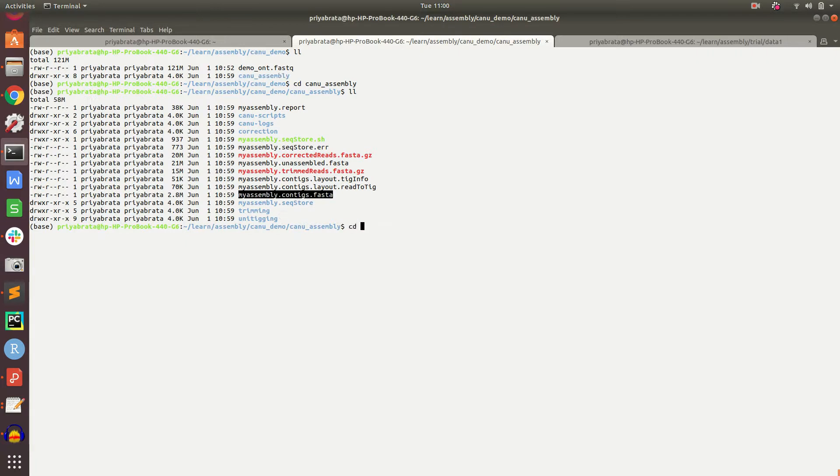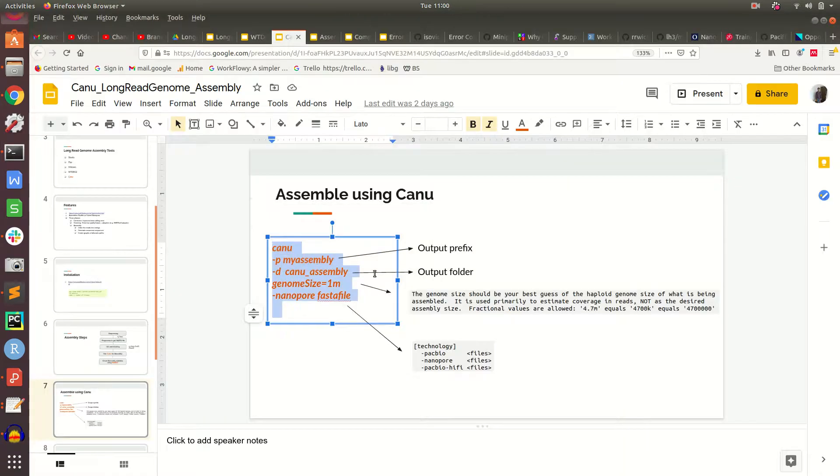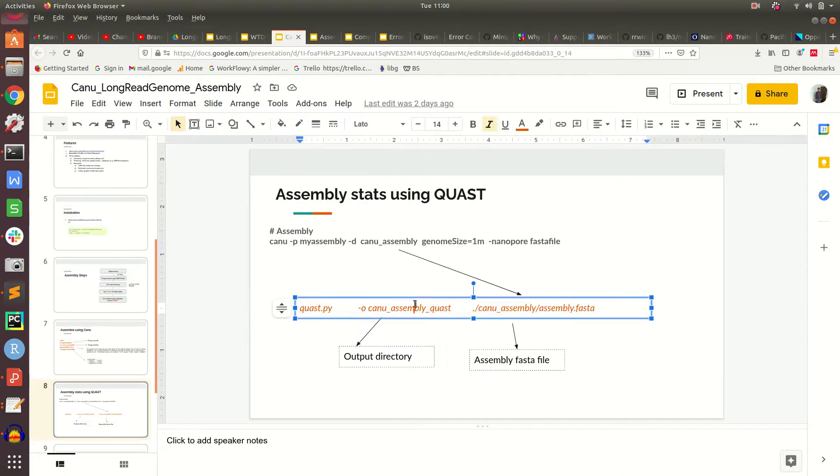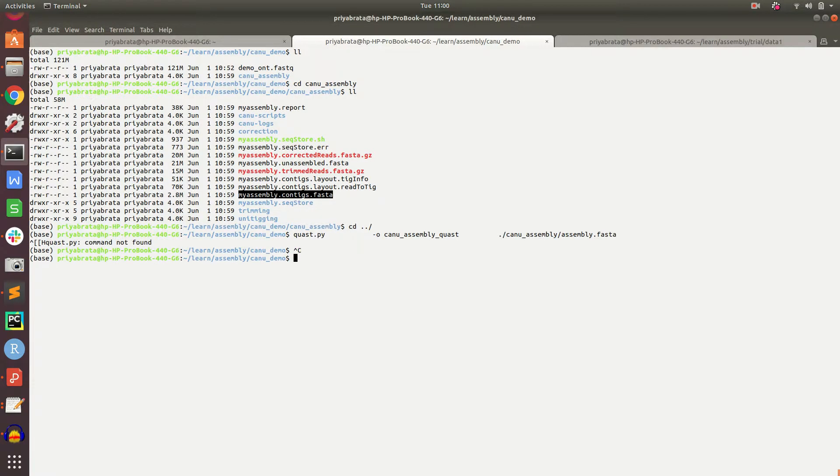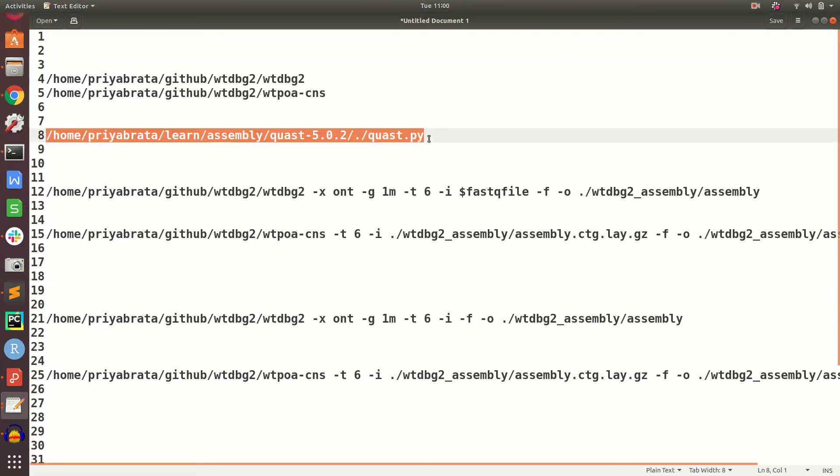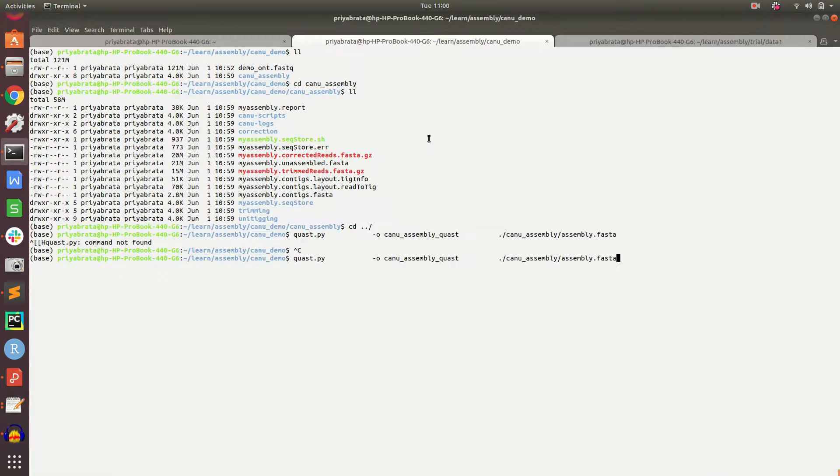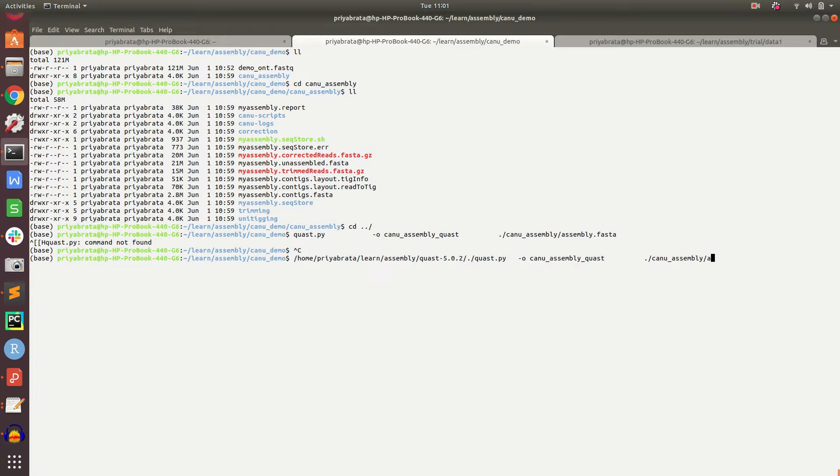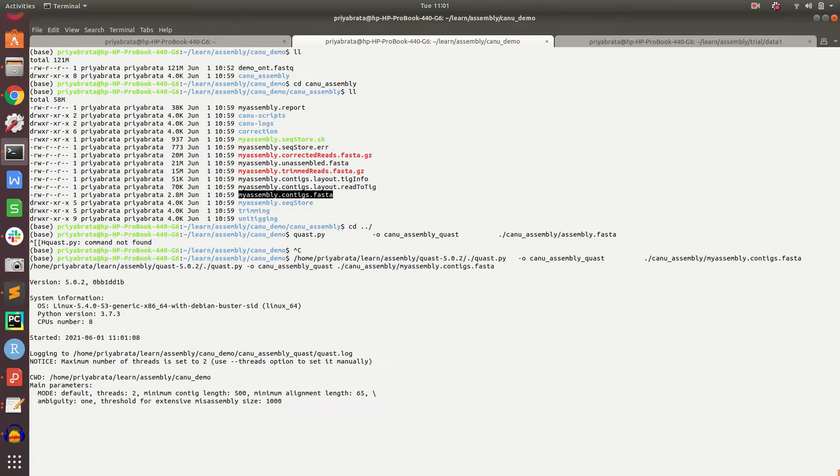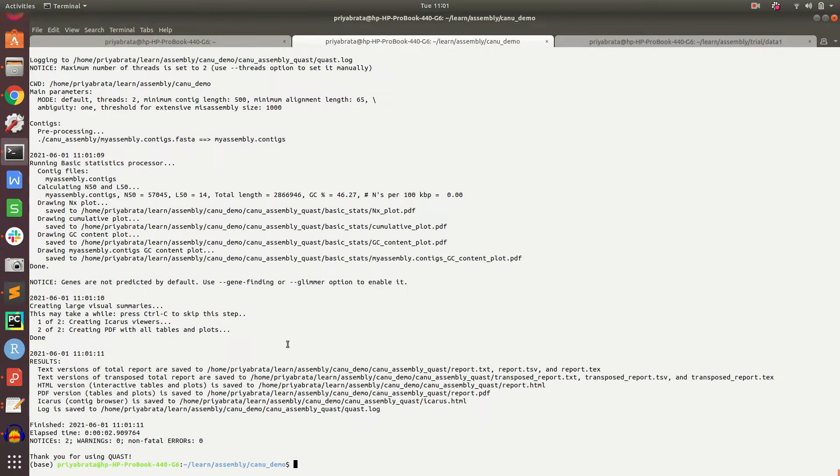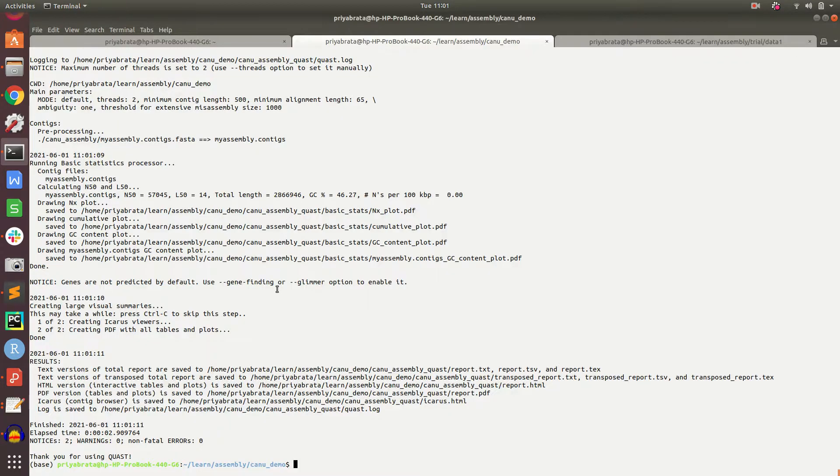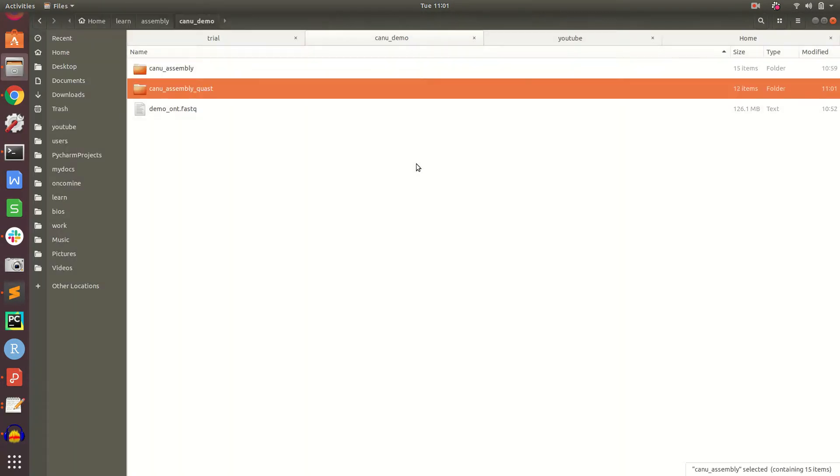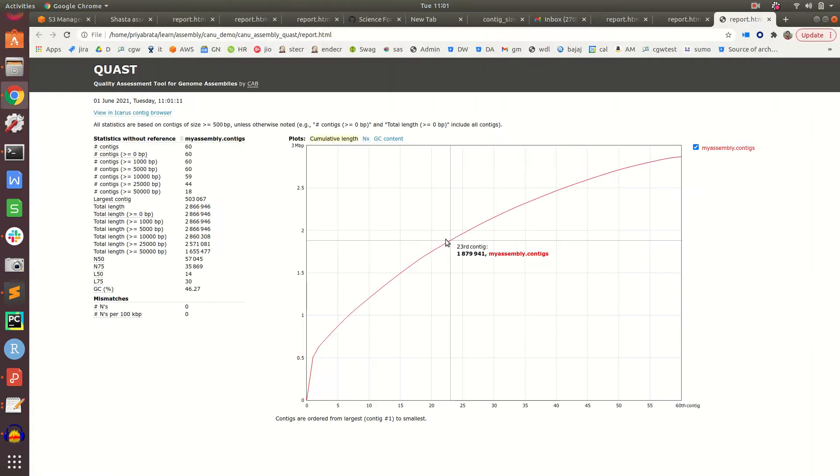The QUAST command is simple. QUAST is installed on my PC, so I'll copy the path and set the output as canu_assembly_quast. Now QUAST is finished and we can open the report.html file.